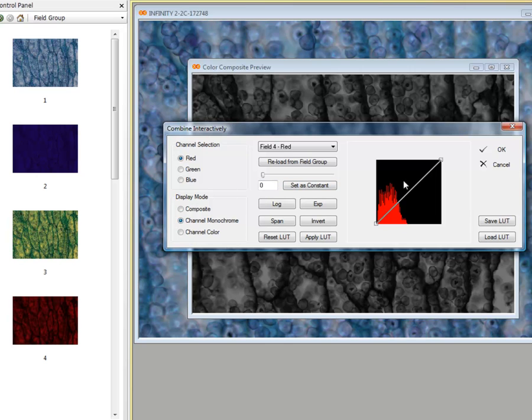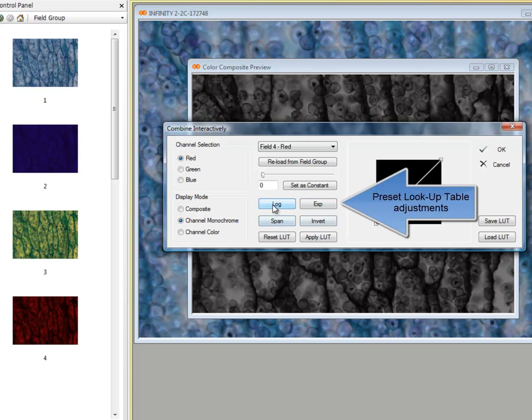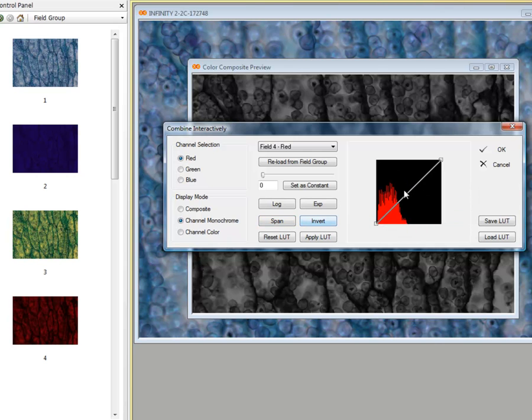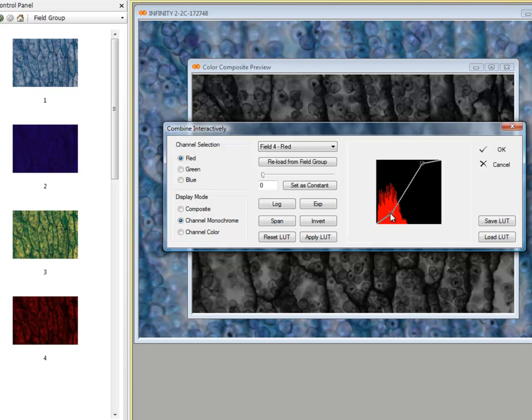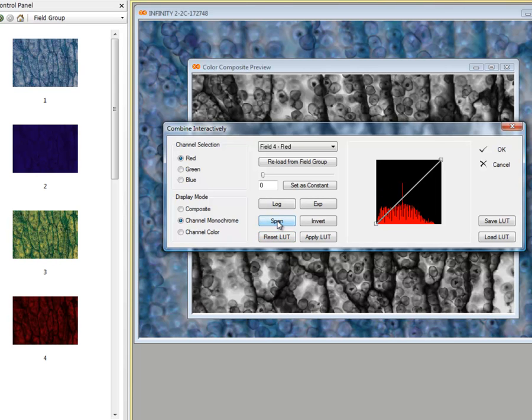Sometimes it's convenient to look at these with the monochrome output option turned on. Looking at the red output channel, I notice that most of my data is in the bottom part of the histogram. I can use some of these controls — logarithmic, exponential, histogram stretch, span, or invert — to manipulate that individual channel using lookup table enhancements. I can also manually control the diagonal line by selecting the nodes with my mouse and moving them to different parts of the image, which gives me specific control over the lookup table. I'm going to reset that lookup table and for the red channel choose span, which stretches the histogram out to fill the available intensity range.